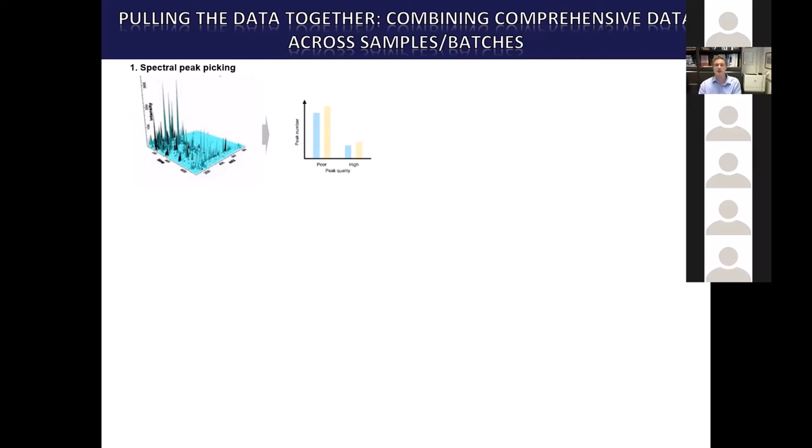And so that needs to be done in a way that allows for some alignment of the chromatography, which from one run to the next is not going to be absolutely the same. It's going to be the same within a second or two, but if you've got, let's say, 3,000 things eluting across a 20-minute run, there's going to be multiple coelutions. And there is a chance that some of those are going to be isobaric, if you're looking at those sugar monophosphates, for example. So you've got to make sure that you can compare them like for like.